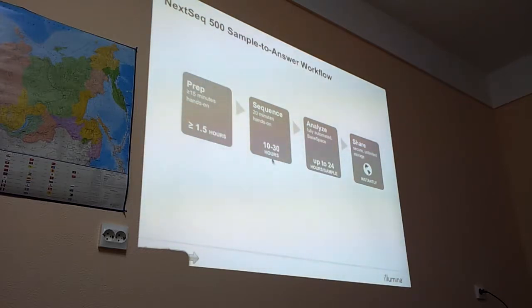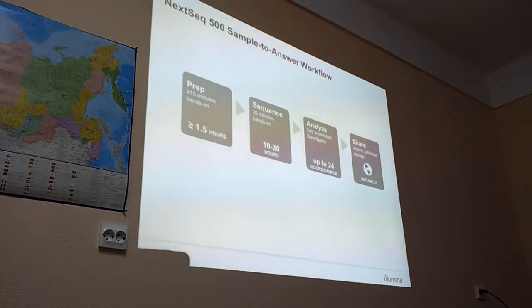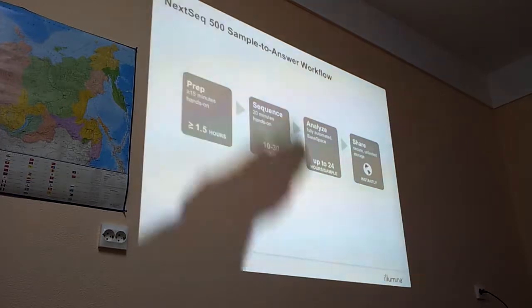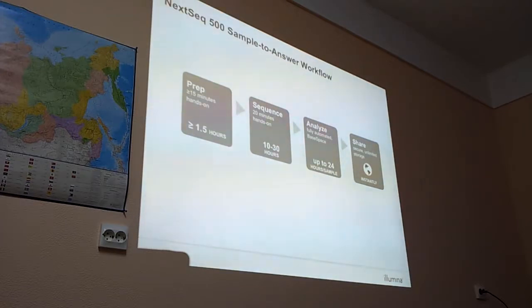So it's just an overview of the workflow. This here is analyze and share the data. This can happen in the cloud. The other reason why we think the cloud is good is because you can share data very easily. So if you have collaboration with institutes in Moscow, you give them permission, they download it immediately, or they can even analyze it in a different way. So you don't have to send a hard disk or do some complicated transfer.